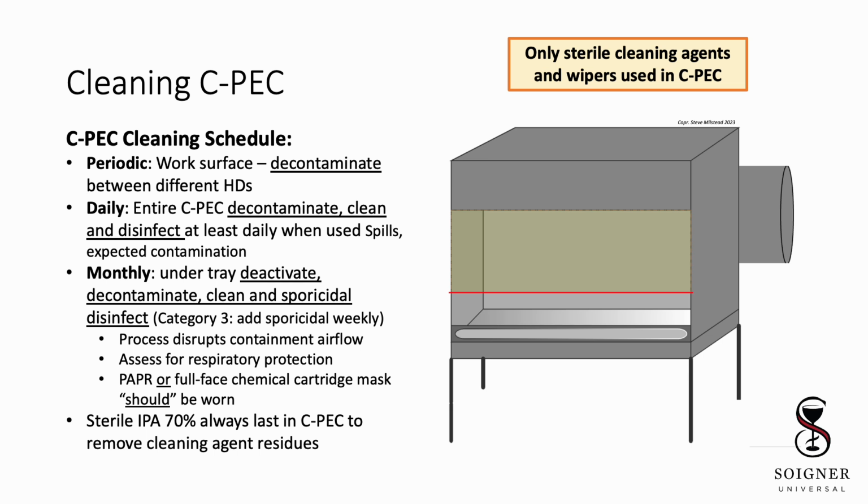One additional note for deactivation, decontamination, cleaning, disinfection of the C-PEC. Best practice would be to apply 2 applications of a one-step product. The first application would be for deactivation, decontamination, and cleaning. The second application will be for disinfection, and therefore the dwell time must be observed during this step.